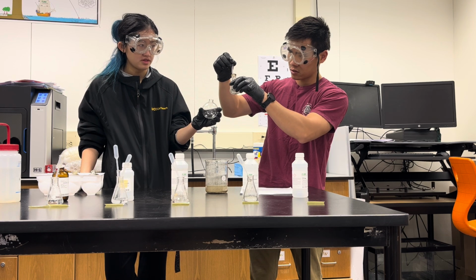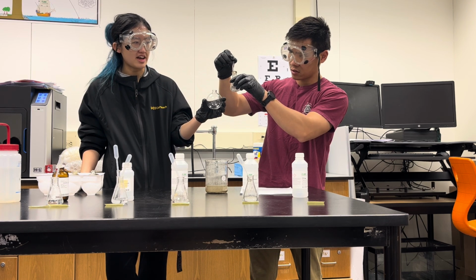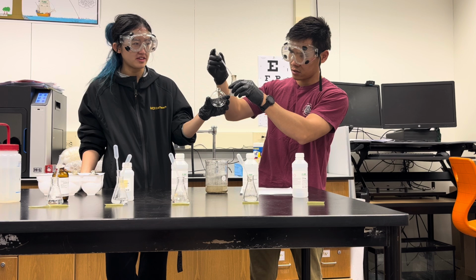So that's how you measure it? Yeah. Be careful though, because the acetone will come out of the pipette.